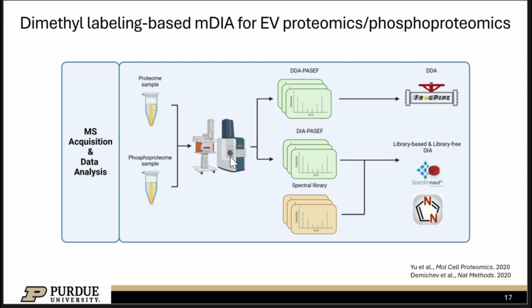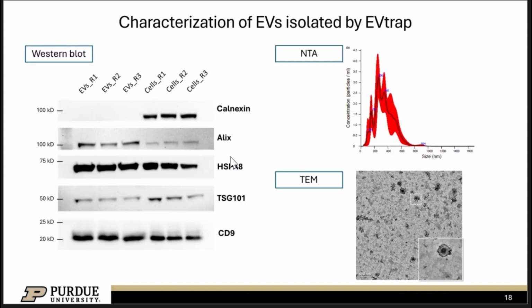So we want to evaluate these different pipelines to determine the optimal results from these pipelines. So first, I want to quickly show the EV characterization.